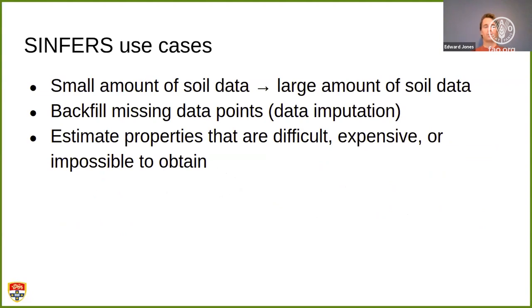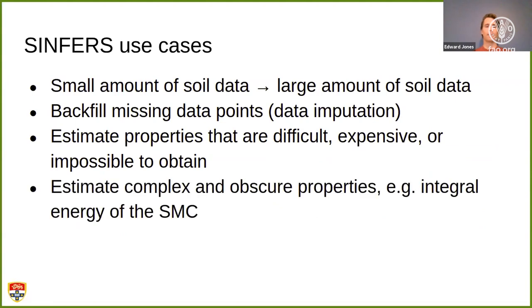You can also estimate properties that are difficult, expensive, or impossible to obtain. And by impossible, I mean if a soil sample has been lost or used up and there isn't enough remaining for a particular analysis. You can also estimate complex and obscure properties, such as the real and imaginary components of the dielectric constants of free water, or the integral energy of the soil moisture characteristic, which is an estimate of the total energy required to extract water from field capacity down to wilting point.